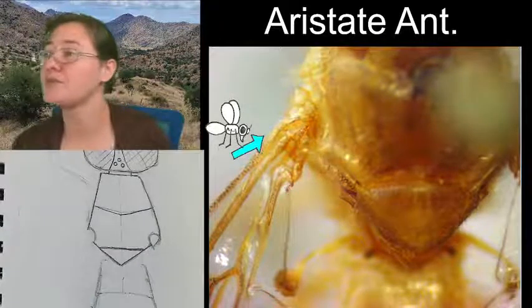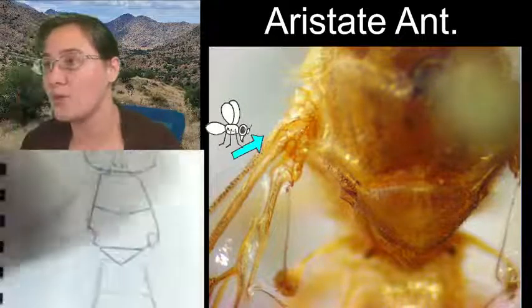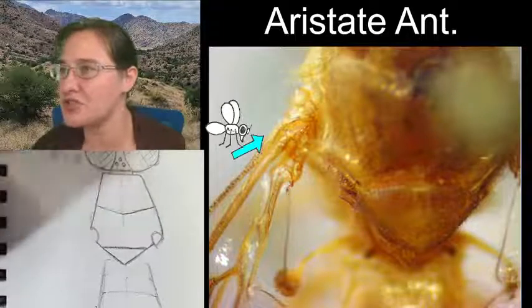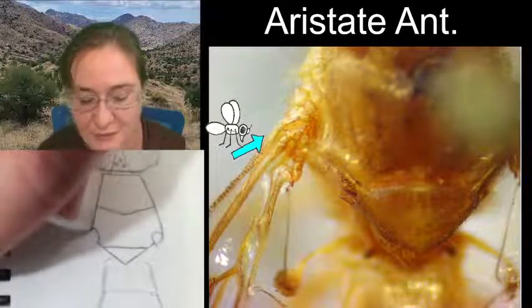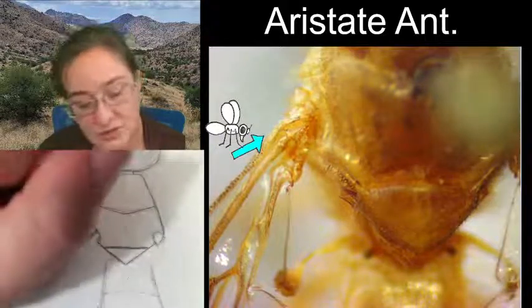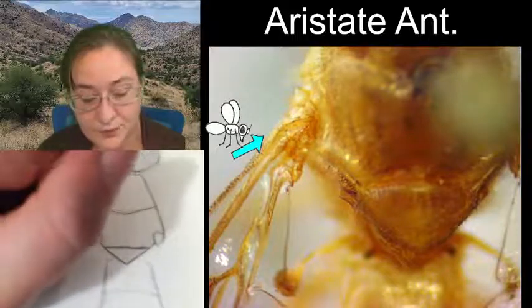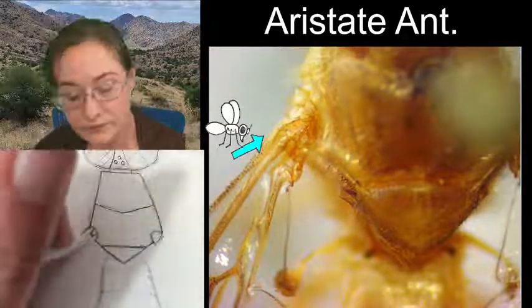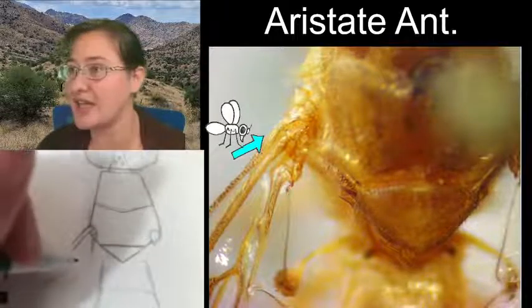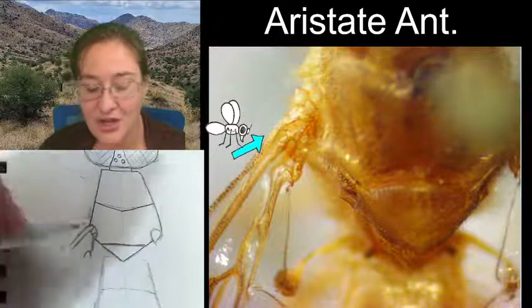line right here. And let's see, at the base of our wings, we've got the top. These are going to be a lot of the costal and subcostal veins at the top of the wing. Let's see, we got this one, and we've got this one. And then when you get closer to the bottom of the wing, those are going to be your anal veins and your anal cells.